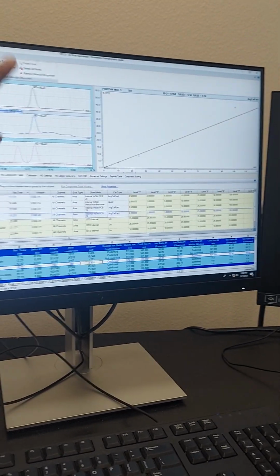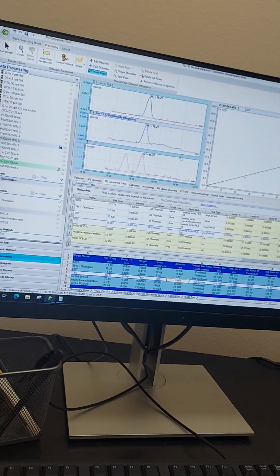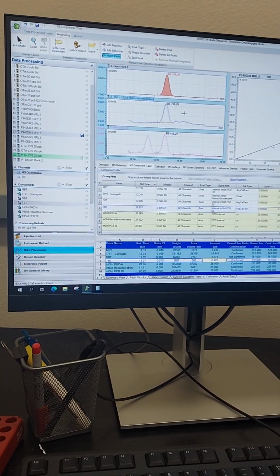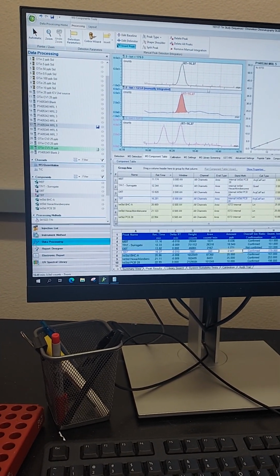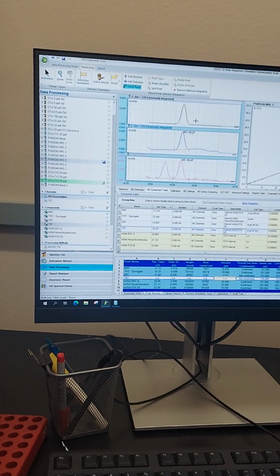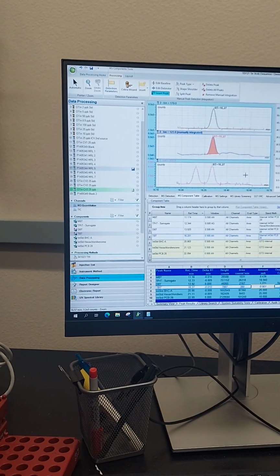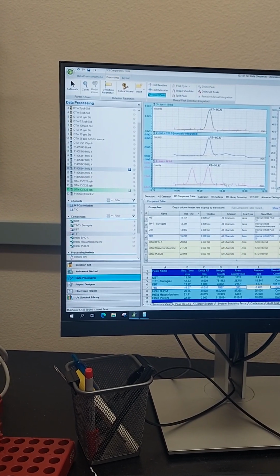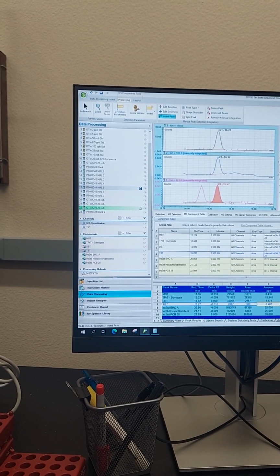You do this and then the others, because you did delete, they'll remove. No. Yeah. So remove all. Make sure you click the box that you want to delete peaks from. Like, if I go here and delete all peaks, it only deletes that one. Okay. And then you can just undo that. I thought it was deleting all. No, because it's like there's choose several peaks, one. So that's what delete all peaks means. Oh. You could click on this tiny peak and then just delete that peak.